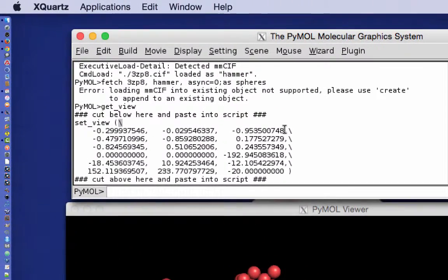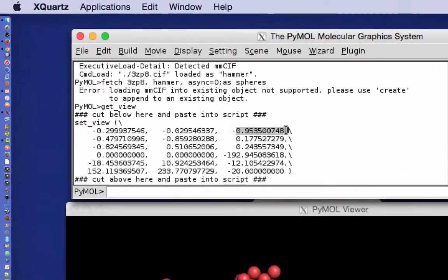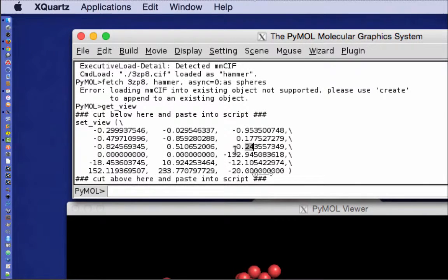They have these backslashes that have to be removed when combining these 7 lines into one line for use on the command line. In addition, they have 9 decimal places, when only 1 or 2 decimal places are really needed for work with biological molecules. Since combining these 7 lines into one is difficult to do, I wrote this script called roundview.py.